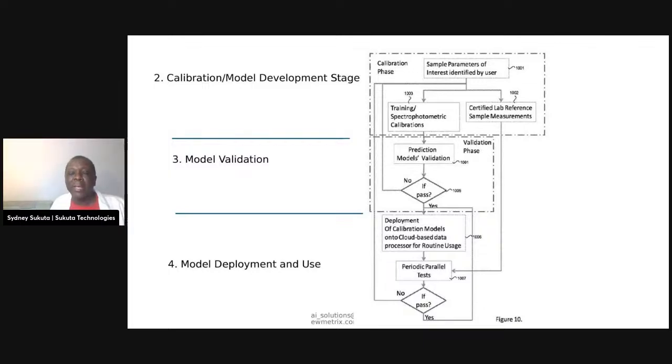Then after that, we do the same thing, but testing the models we built. If it fails, we just keep going back until it passes. Then it goes to the next stage after it passes validation. And now we can deploy. And then they can be used. However, due to machine drift, it's always a good idea to periodically double check these models, make sure there's no drift, because we're dealing with machines here. So that's what we do. These are ready for use when they're ready for use.